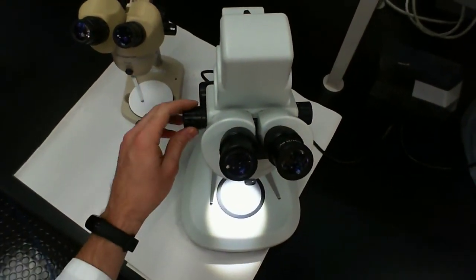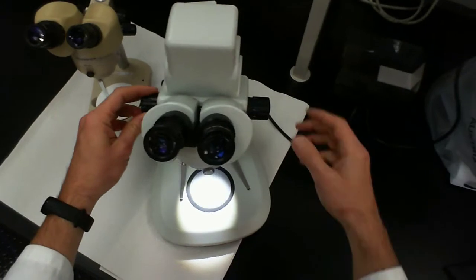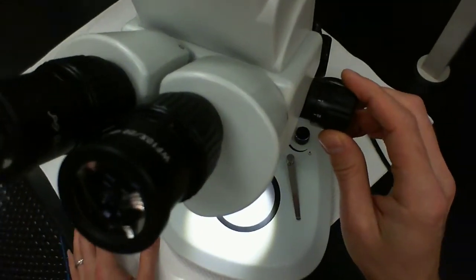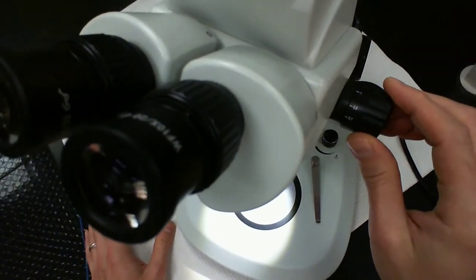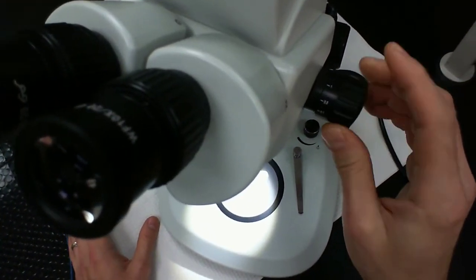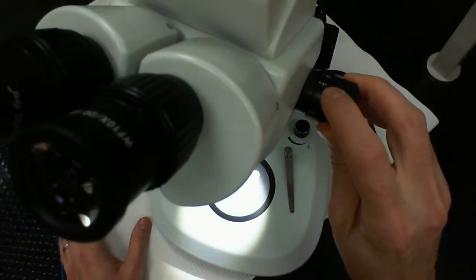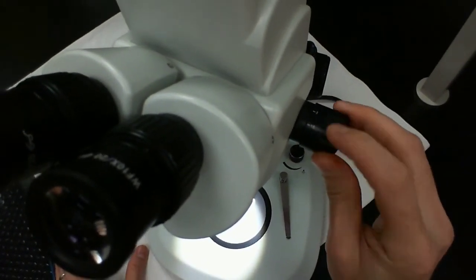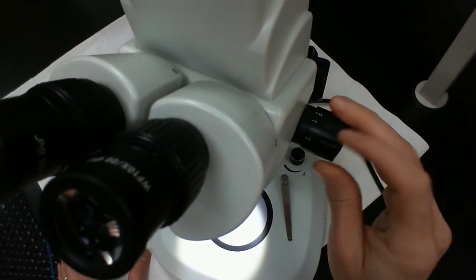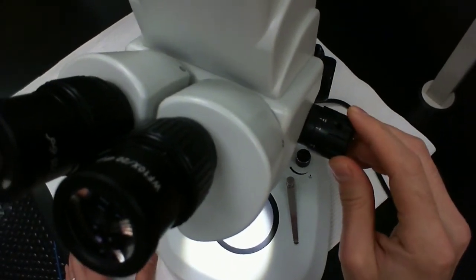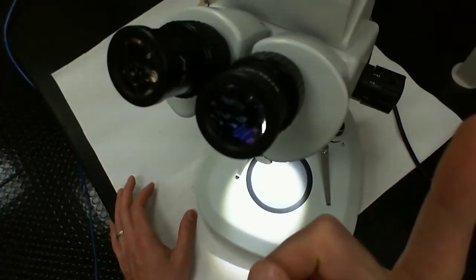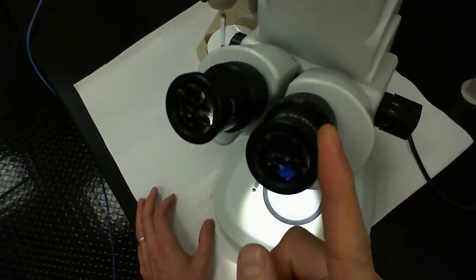This is a magnification adjustment knob over here and on this side as well. You can actually see the numbers on here. This newer microscope actually allows you to have a continuous change in magnification. The numbers start out at 0.7, 0.8, 1, 1.5, 2, 3, 4, and 4.5. The objective lens magnification is not very high and has to be multiplied by the ocular lens magnification, which is 10x.